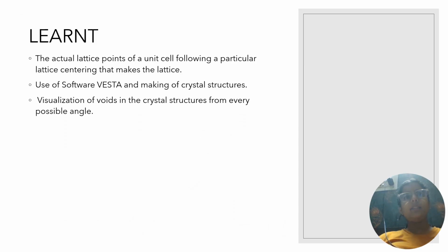So in this slide we have learned the actual lattice points of the unit cells following a particular lattice centering that makes the lattice. We have learned the use of software VESTA and making CIF files and uploading them on VESTA, making the crystal structures, and visualization of voids in the crystal structure from every possible angle we have seen.